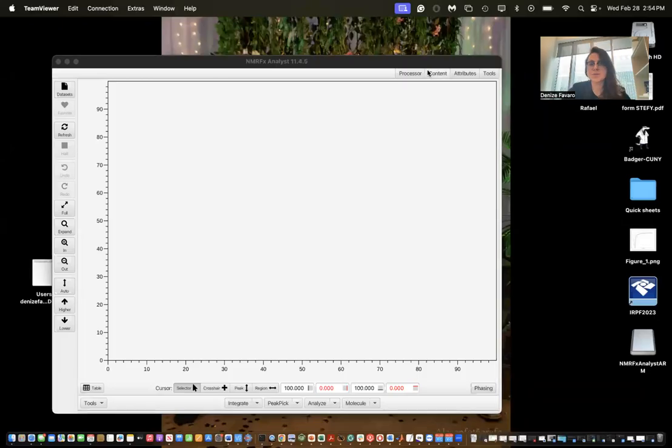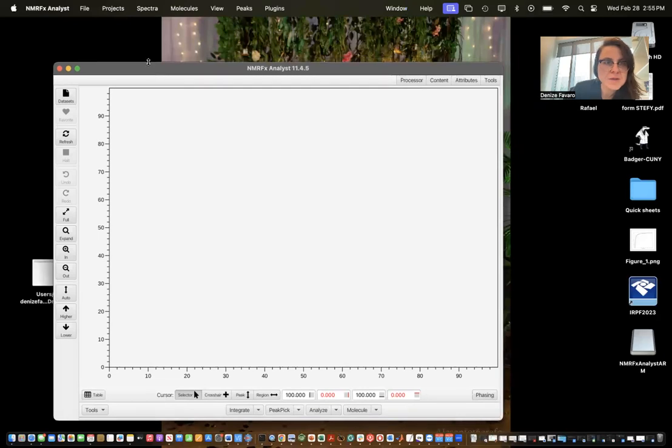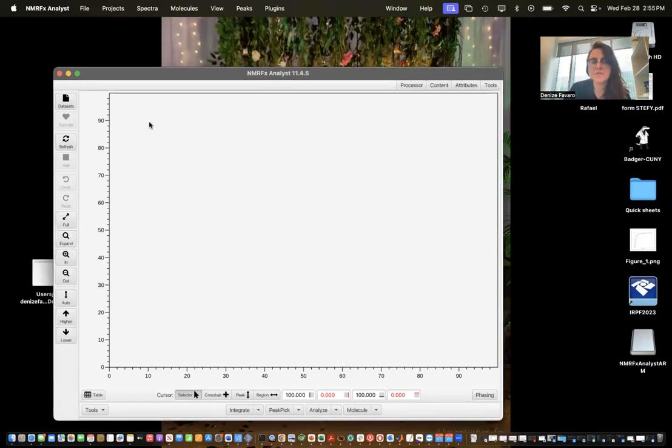So I'll try to show how to use this really nice program called NMRFx that is developed by, and is still being developed by Professor Bruce Johnson, who is a really nice person. If I'm not able to show you how to do the process, you can always ask him or look at the documentation on his website.